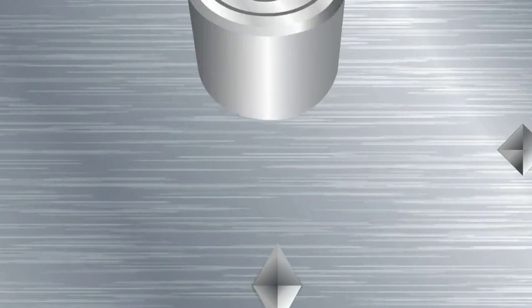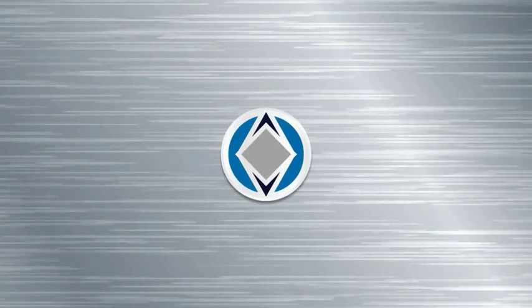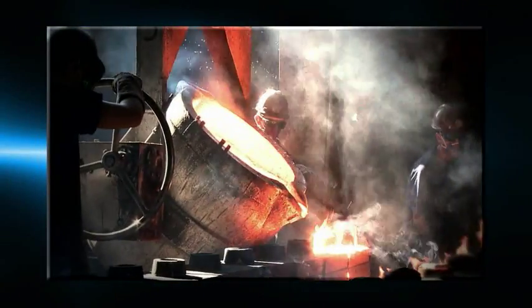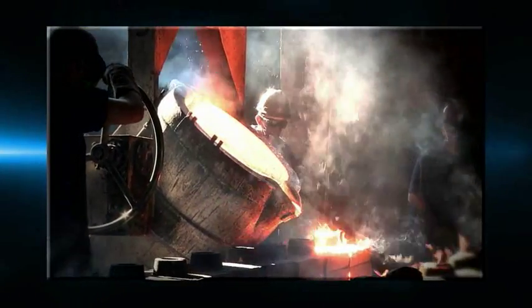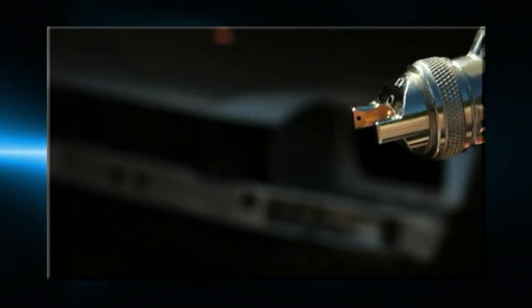Best-in-class hardness tester and premier automation software combine to produce the world's leading hardness testing solution for a multitude of applications, such as the inspection of heat-treated parts, welded samples, and coatings.